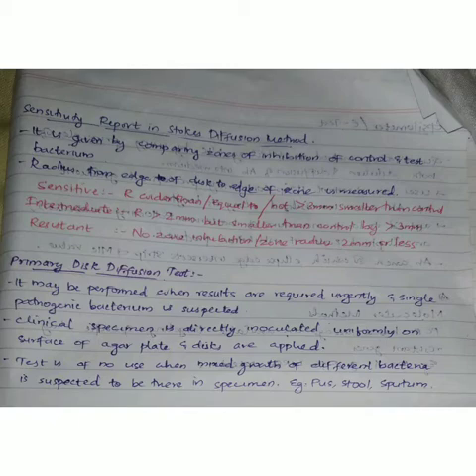Next is the primary disc diffusion test. It may be performed when the results are required urgently and a single pathogenic bacterium is suspected.